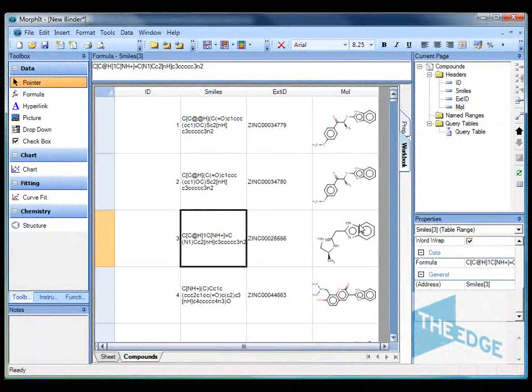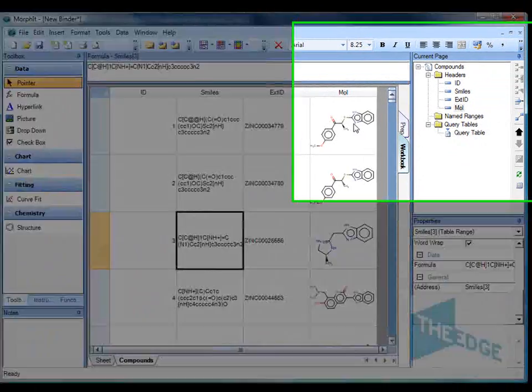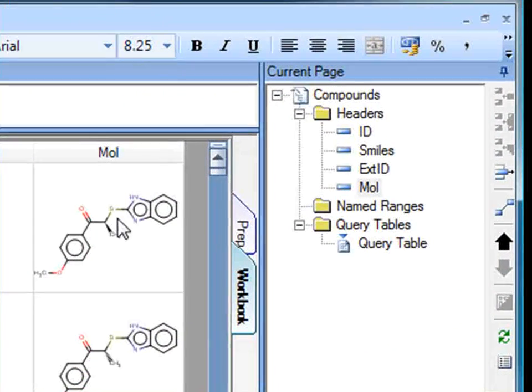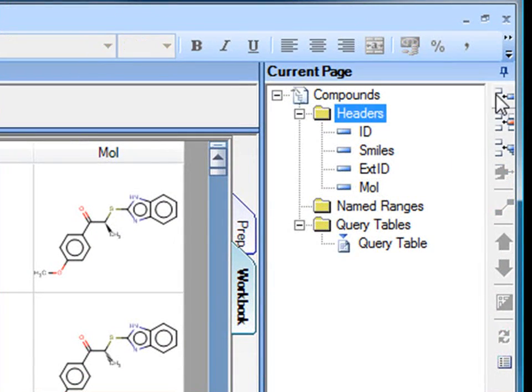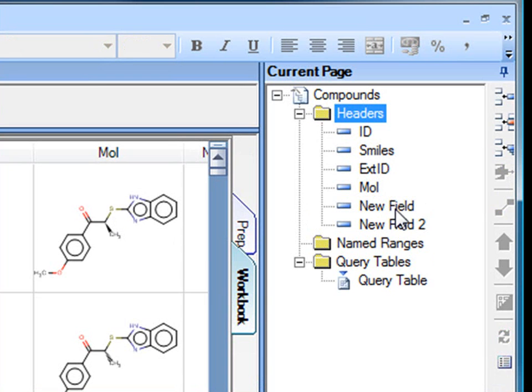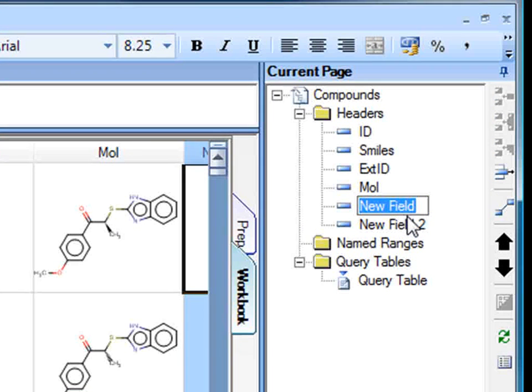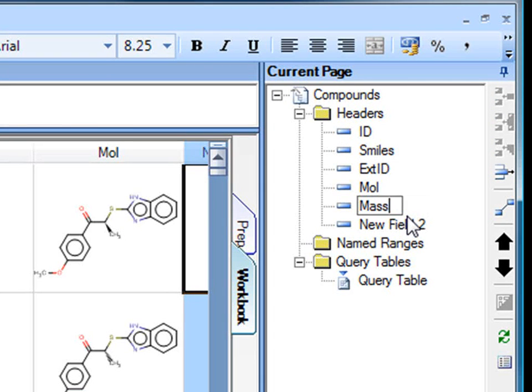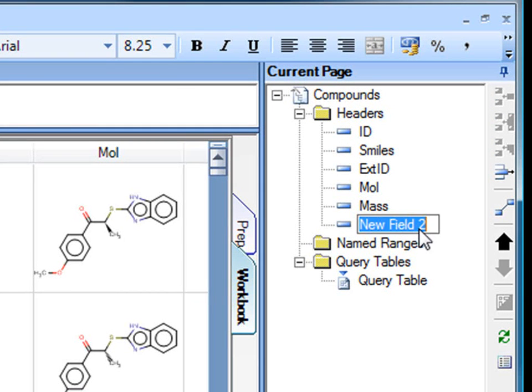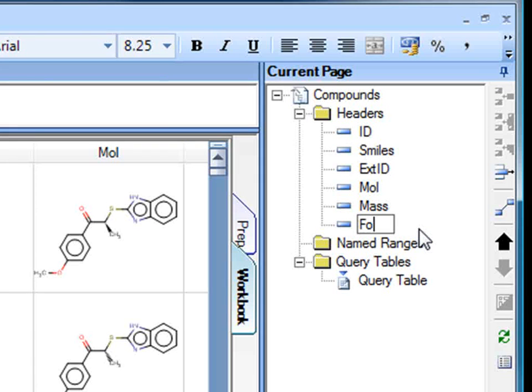Okay, next thing I would like to do is to calculate the mass and formula based on these structures. So I'm going to add two more fields here. One is going to be called mass, the average molecular mass, the second one is going to be called formula.